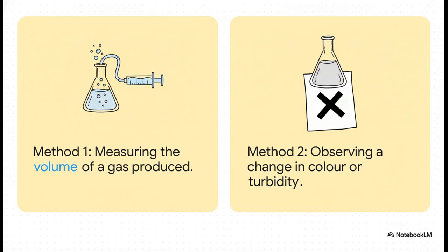Now, the cool thing is, AQA gives you a couple of ways to tackle this. Method 1 is all about measuring gas. And method 2, that one's about watching a solution get cloudy. It's a bit like a magic trick. We're going to look at both.